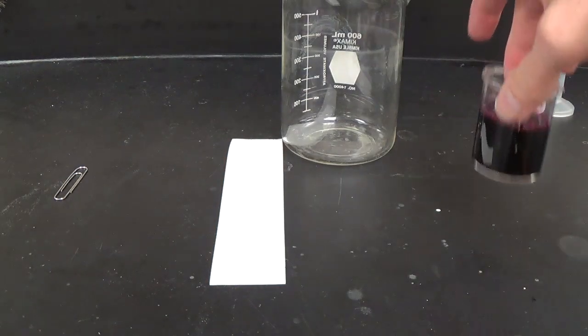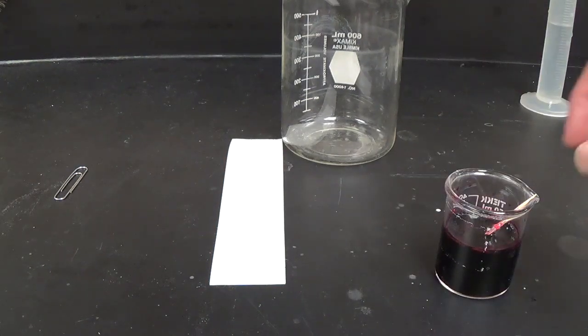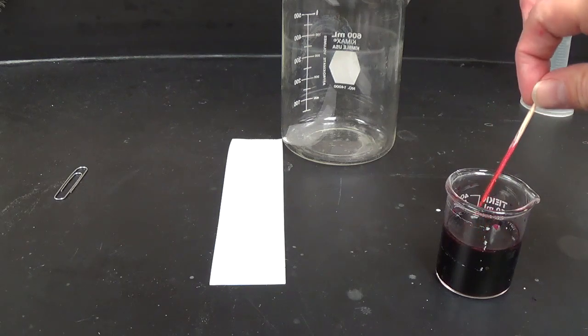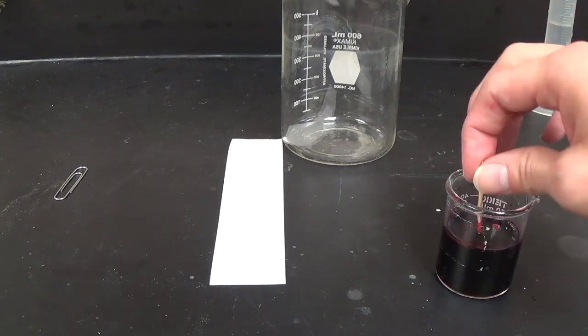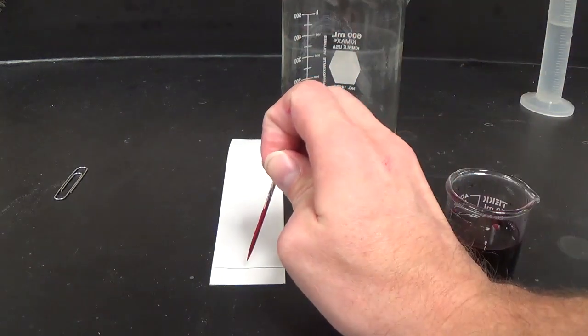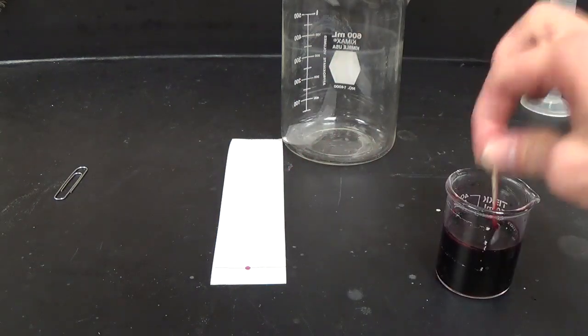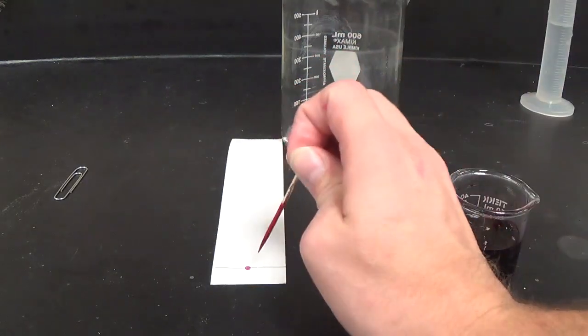So I have purple stuff. And you, of course, will know in class what we're using. It's going to be a common everyday thing. But I'm going to take the toothpick that's soaking in my purple stuff, and I'm going to use the tip of the toothpick by holding it on the starting line to put a dot. And I'm going to re-dip, and I'm going to tap it once again.